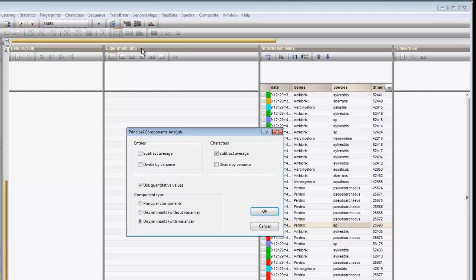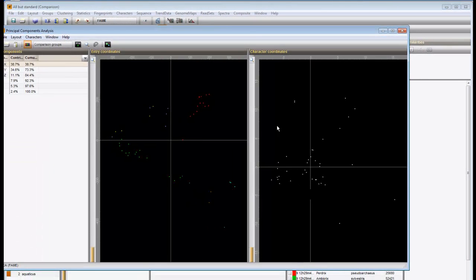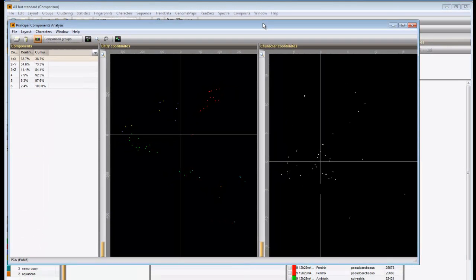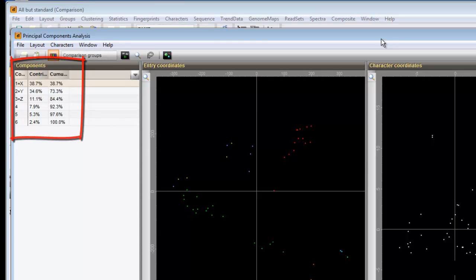Press OK to start a calculation. In the components panel, the components are shown with their relative contribution and the cumulative contribution displayed. Also the components used as x, y and z-axis are indicated.